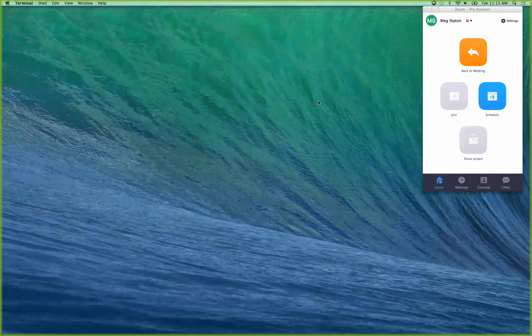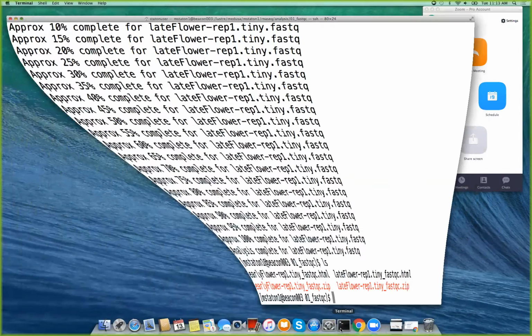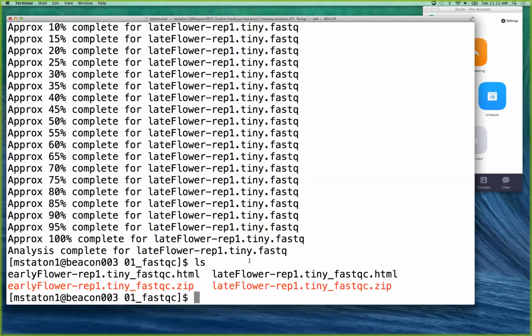You have the instructions which install that. Install instructions? Yes, I can share those with you. Fast QC in particular is super easy. You just download it, stick it in a directory somewhere, and it just works. Not all of them are that easy, unfortunately, but Fast QC is pretty easy.